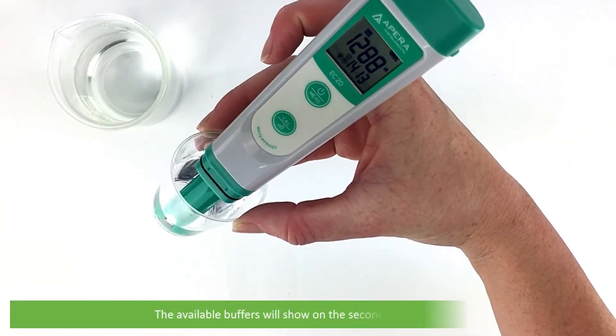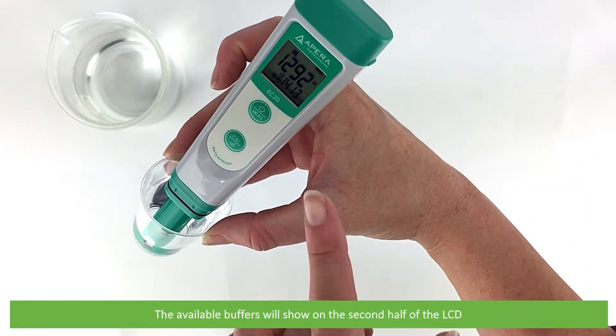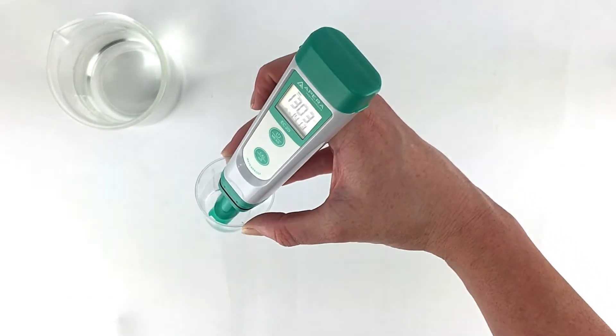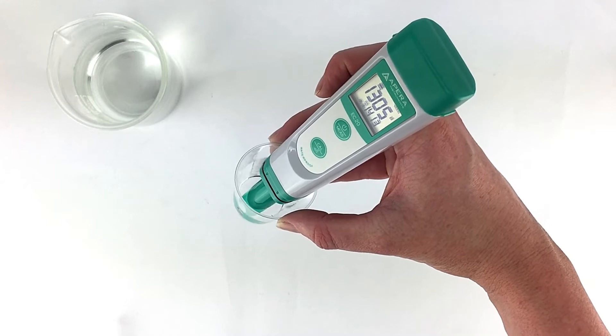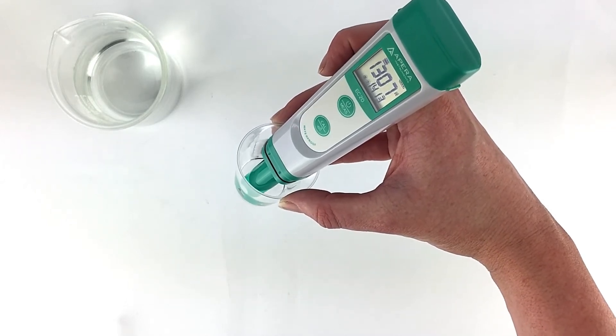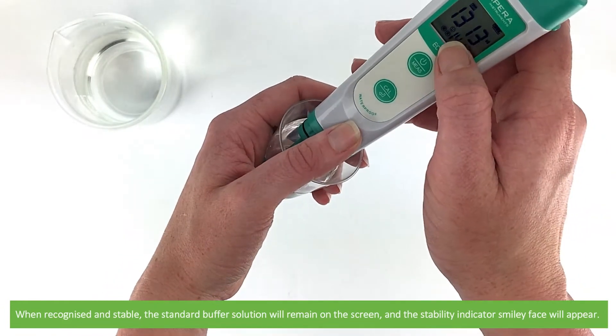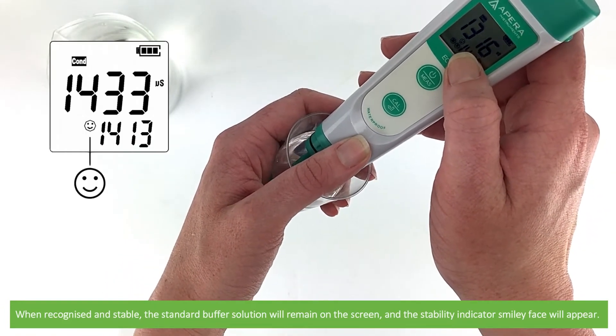The available buffers will show on the second half of the LCD. When recognised and stable, the standard buffer solution will remain on the screen and the stability indicator smiley face will appear.